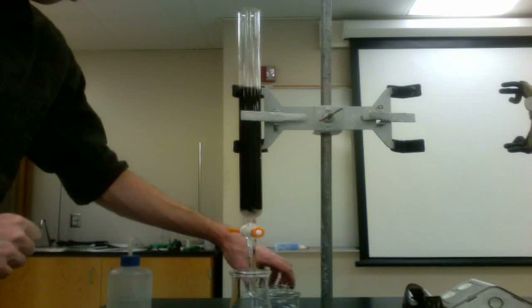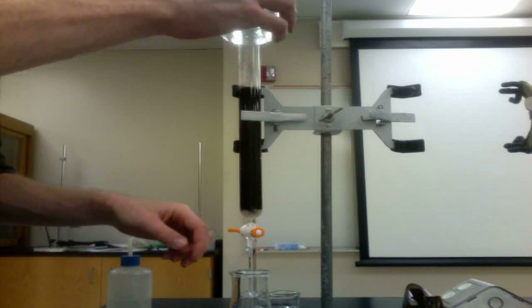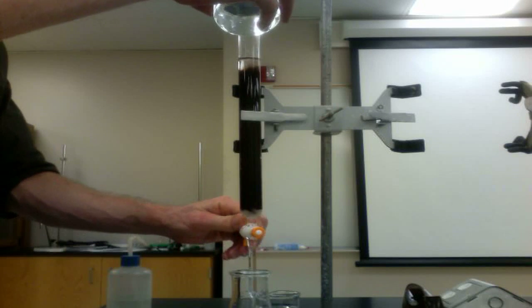Before the titration, we must regenerate the ion exchange column. This is done by running an acid through the column. Before adding the acid, be sure to lower the water level in the column to the height of the resin.